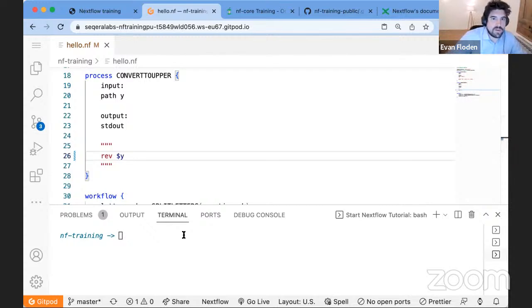What happens if I want to do this, but I don't want to rerun the pipeline from the beginning? I don't want to wait for all the processes. Now, this is a trivial example because I showed you it takes a second to run. But in cases where it might take days to launch a pipeline, this is obviously not an ideal situation. What we can do is exactly the same as before, but now specify resume, so nextflow run hello single -resume.